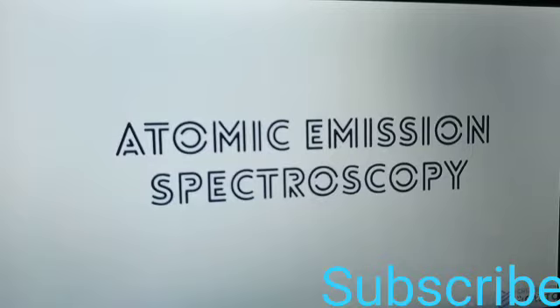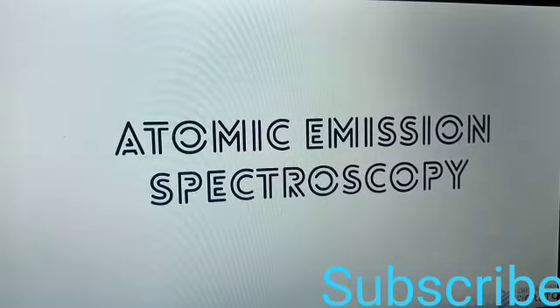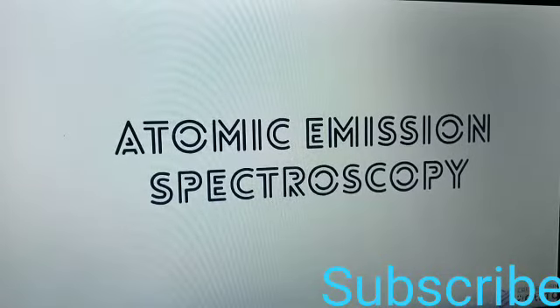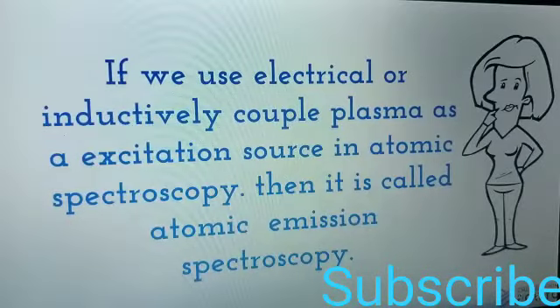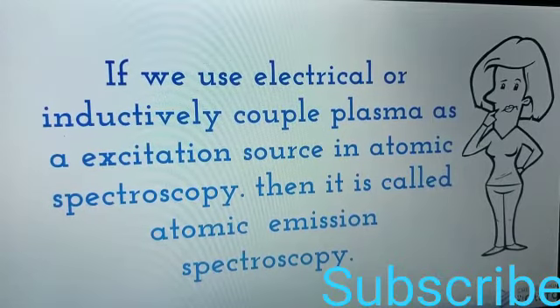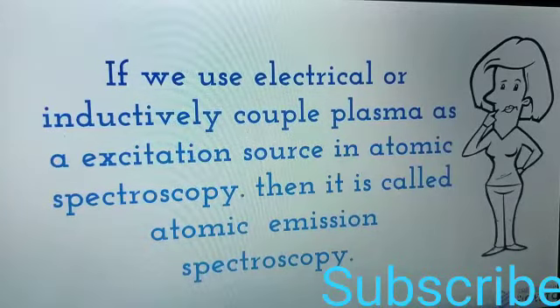What is atomic emission spectroscopy? If we use electrical or inductively coupled plasma as an excitation source in atomic spectroscopy, then it is called atomic emission spectroscopy.